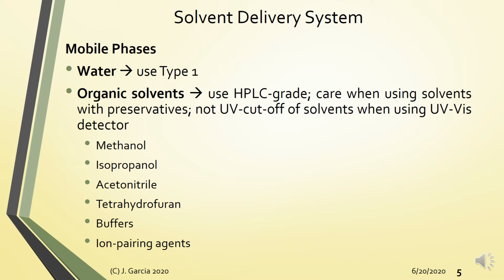Non-polar organic solvents are also used, especially for normal phase chromatography. So you have yung mga hexane, xylene, benzene, toluene. So again, just be mindful of the UV cutoff and kailangan HPLC grade.